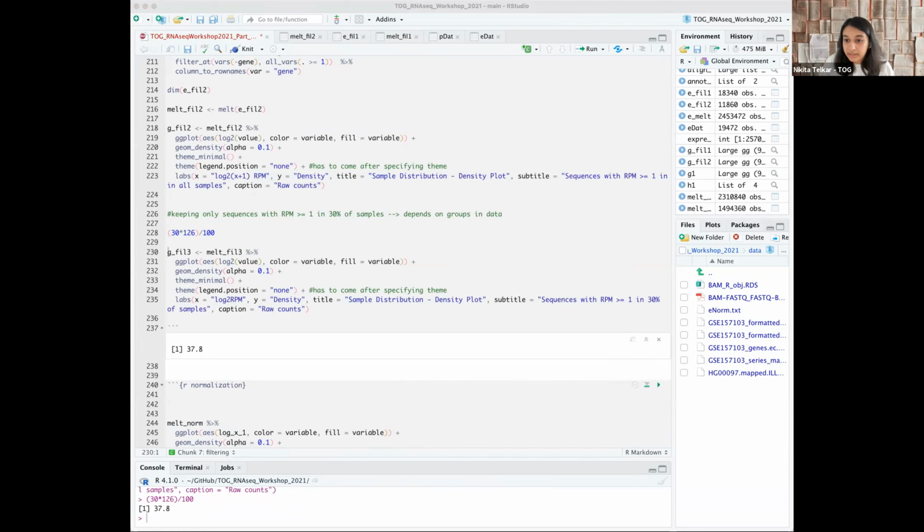Copy paste all of that with the comments that I have in the code share. All of this is again found in the main document. So what we're going to do is use these steps here.